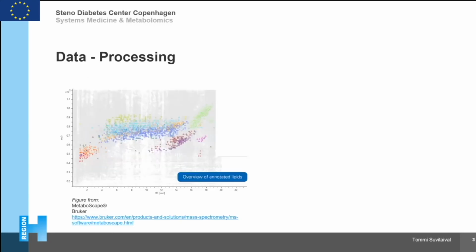So first, about processing, as Caroline also showed in some slides, we get this kind of overview of data from mass spectrometry. We have compounds of different masses coming through the chromatography at different times, and each of these gray dots in this map is potentially a unique compound. We don't know at this stage, but that's possible. And then we need to crunch these into something meaningful.